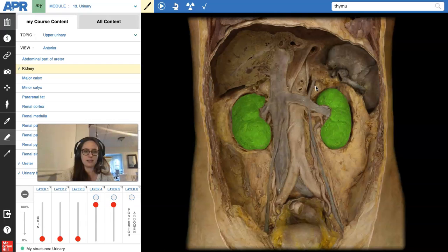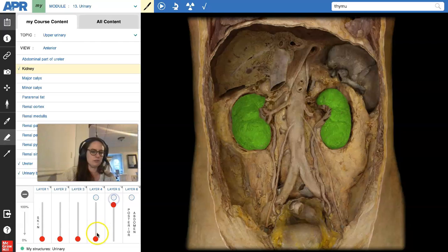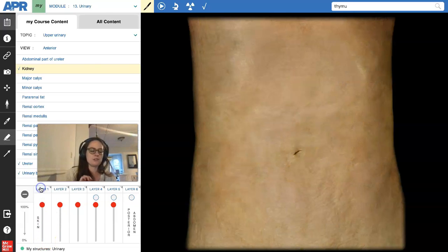That is the entire dissection. Obviously, if this were real life, it would take a little bit longer. But when you do this on a fetal pig, it's about this rewarding. You get in pretty quickly, you explore all the structures pretty quickly, but you get a really nice integrated view of how these things are put together, how you get from one piece to the next. There's your psoas muscle back there. Let's put all of our stuff back. Not that you can do that in real life, but again, just go backwards.